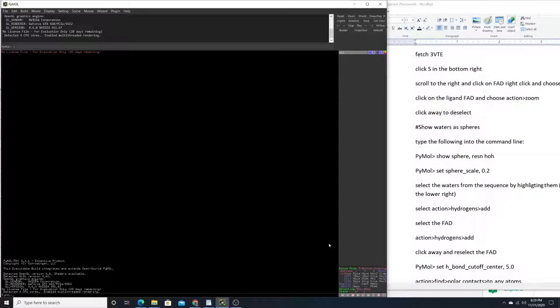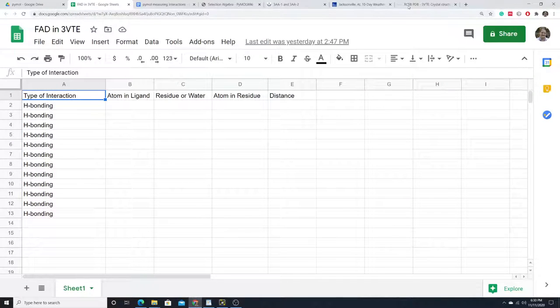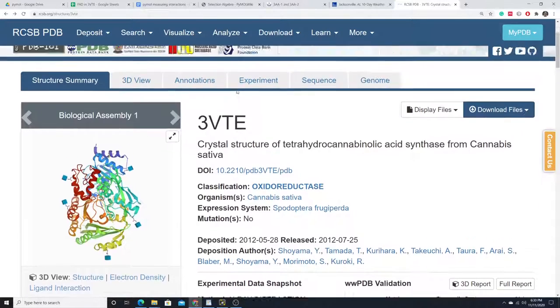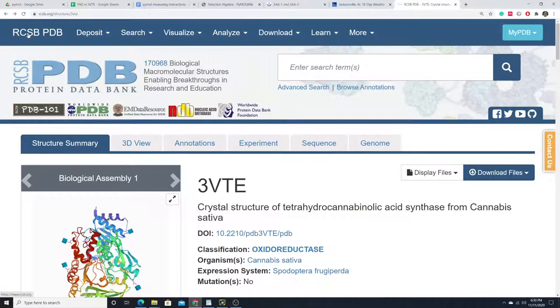In this video we'll be discussing how to measure distances in a binding pocket from a protein or enzyme that already has a ligand bound. We're going to study the binding pocket and make a chart of those distances and the types of interactions that we see. For this video we'll be using the crystal structure of 3VTE, which we can obtain from the Protein Data Bank, rcsb.org.